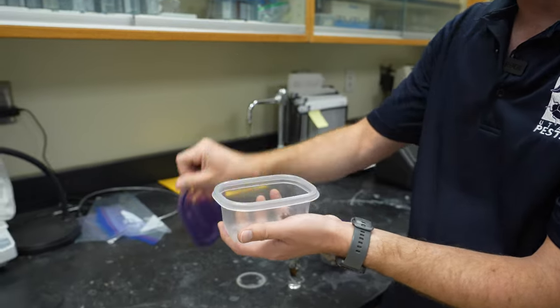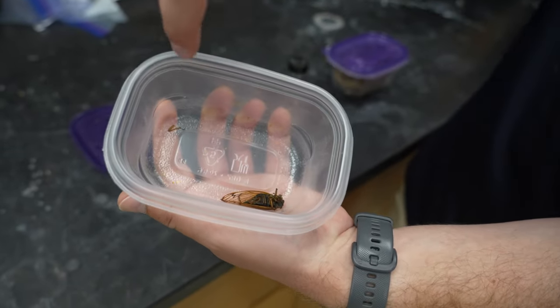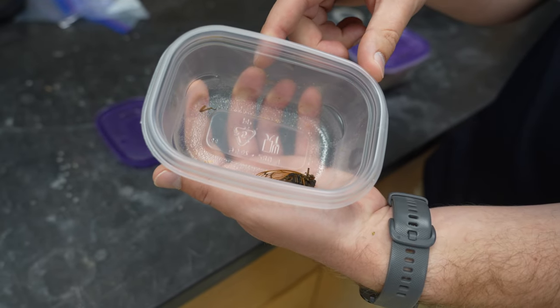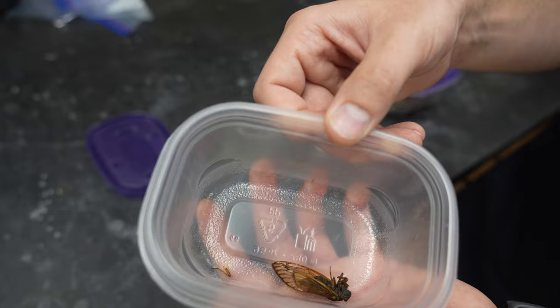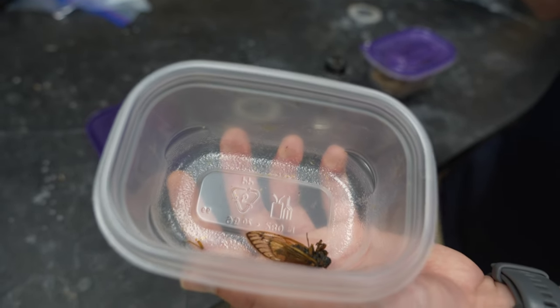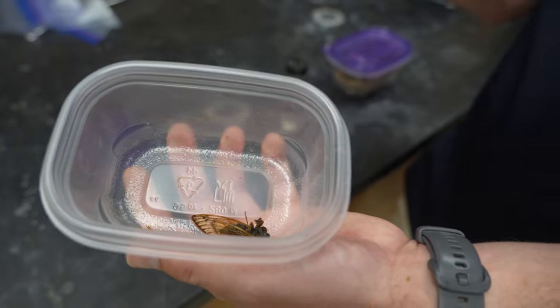This is an example of a poorly sent-in cicada sample. As we can see, a little leg of this cicada broke off and is sitting on the side. If this were in a shipping container, it would fly around, get broken, and that could impact our ability to identify that insect — especially if the insect is quite small and otherwise nondescript.